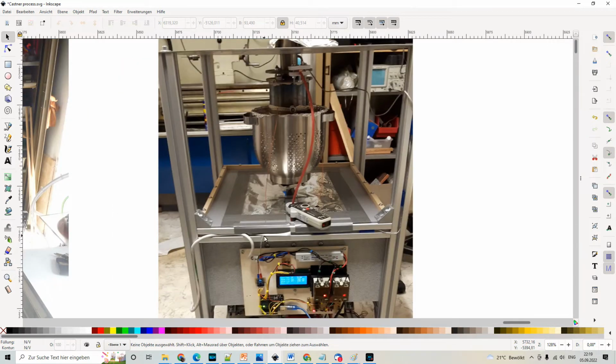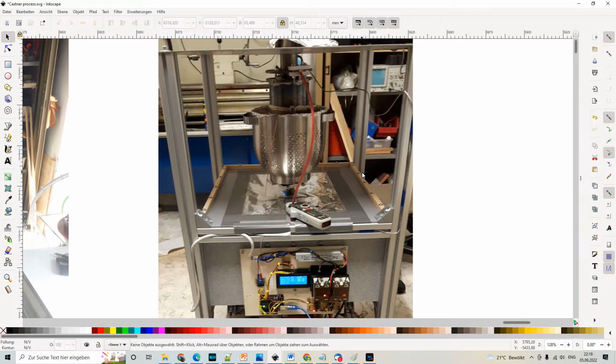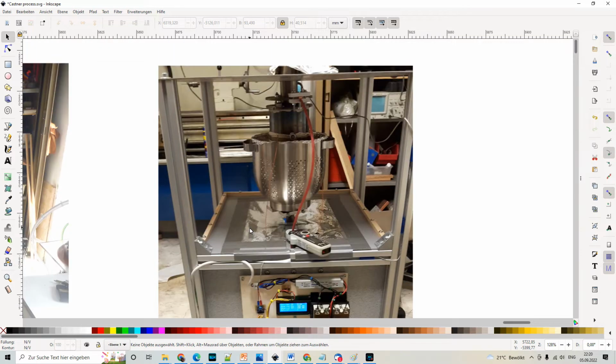First of all, I want to show you some images of how the Castner cell looked. Because this is a very old project, the Castner cell doesn't exist anymore, as I used all the parts for other projects. In the old days I couldn't buy sodium, but nowadays I can, so I don't mess around with distilling it anymore. But there are many places in the world where sodium is not easily available. In this case, building your own Castner cell is still a good choice to make your own sodium. So this is how it looked.